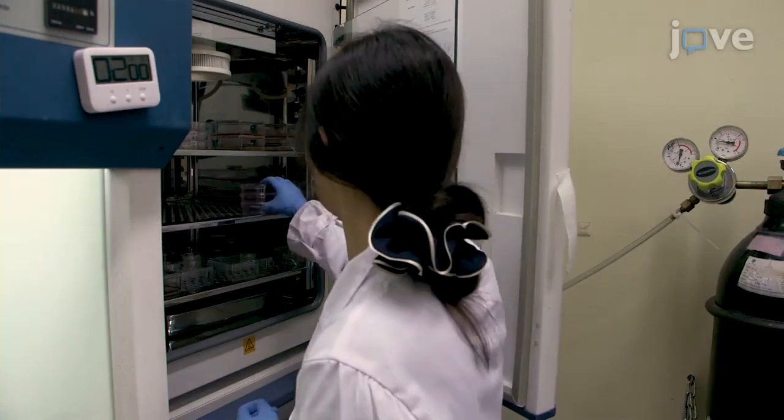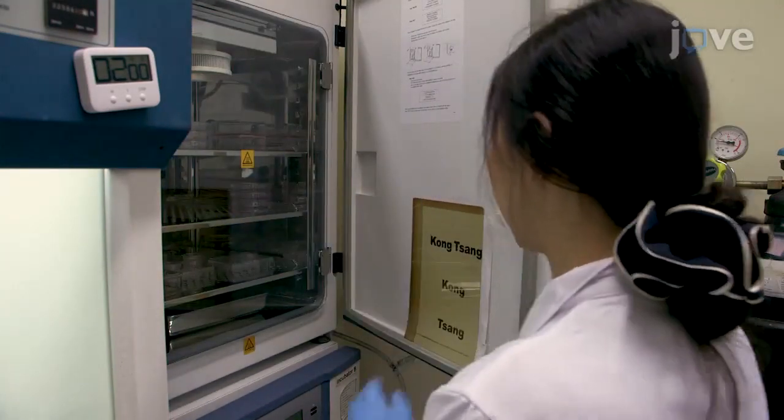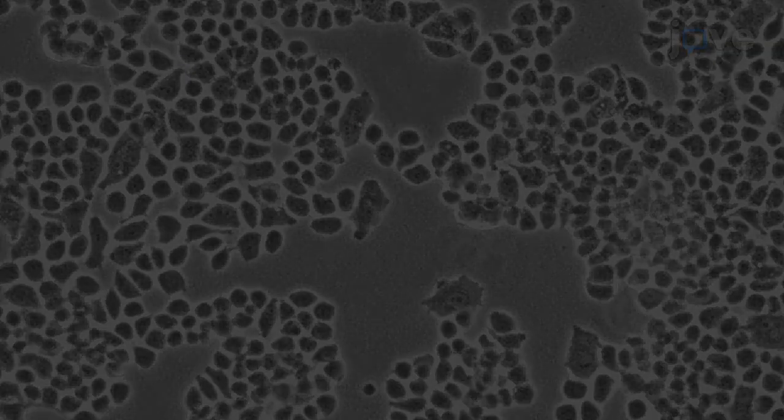Culture the cells for 5 minutes at 37 degrees Celsius in a 5% carbon dioxide cell culture incubator. While the cells incubate, check the detachment of the cells with a microscope.